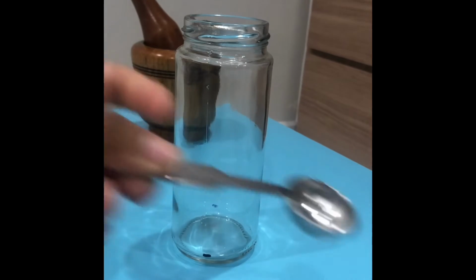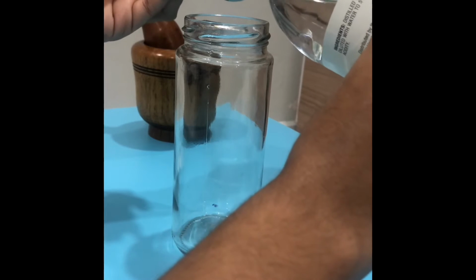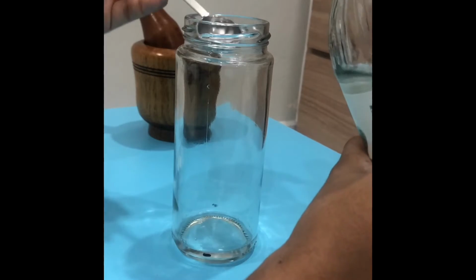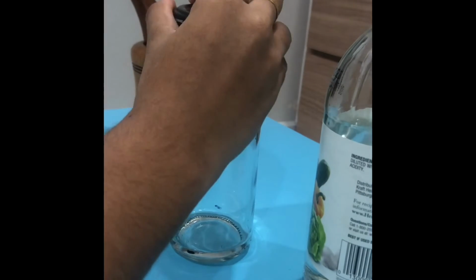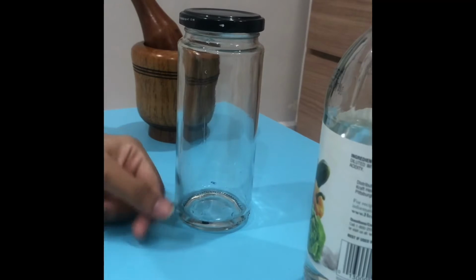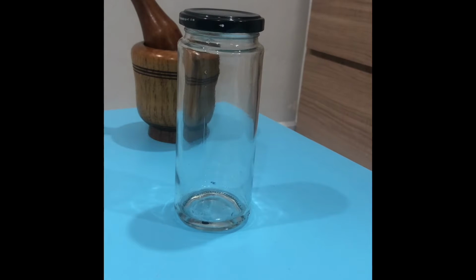Okay, so as usual I'll be using the same spoon. Measuring 5 ml in, which is just about right, not exceeding the mark on the jar. So now I need to stopper the jar so that I would prevent the vinegar from vaporizing. Moving on to task 3 now.